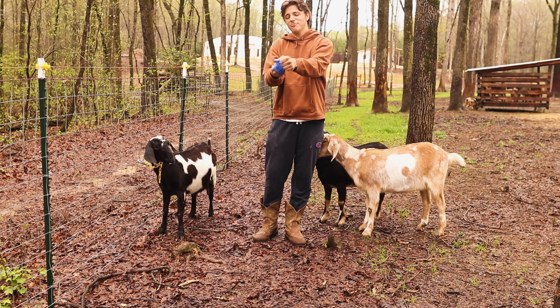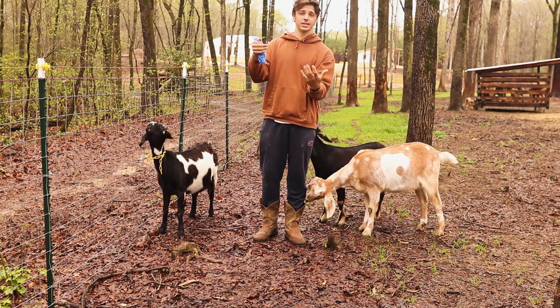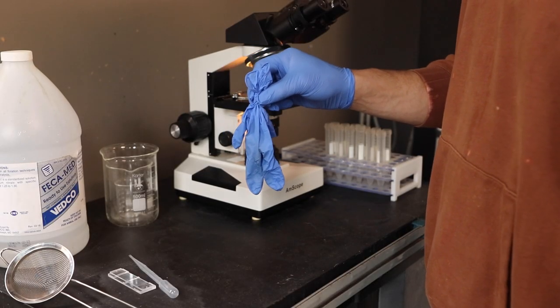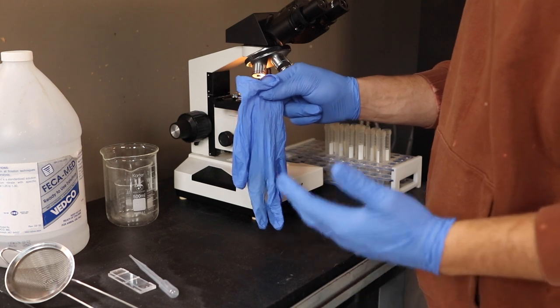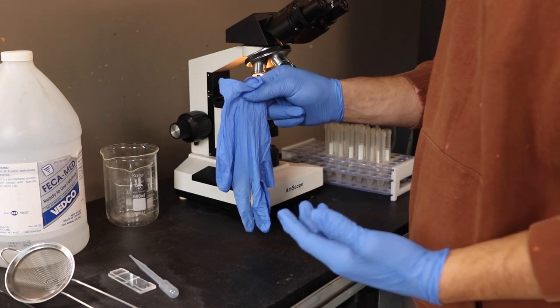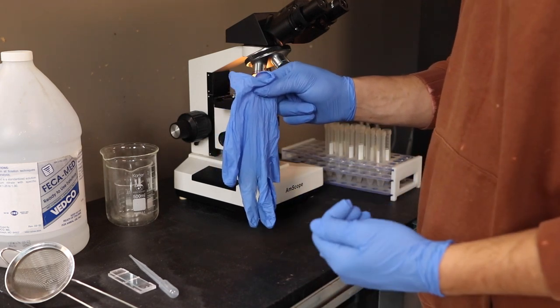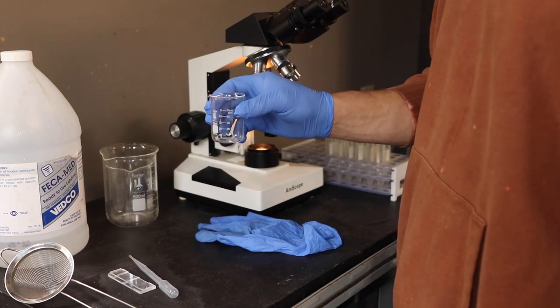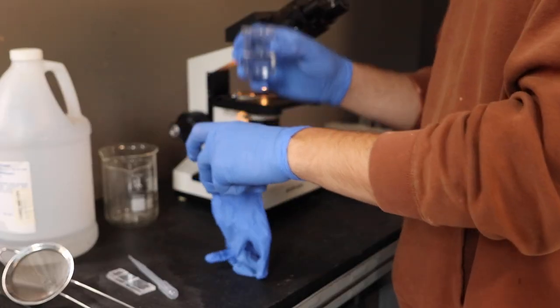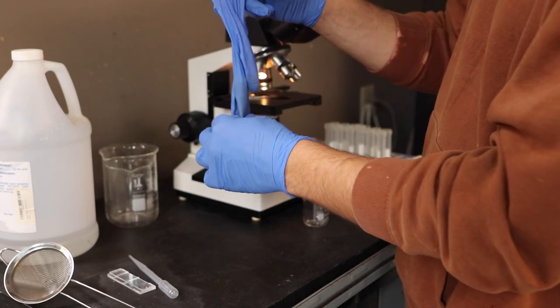I'm going to go ahead and twist my glove inside out — this is what we'll add the solution to later. The ratio that we're going to use is 15 cc's of the fecal solution for every one gram of goat poop. We have two grams of goat poop, which means we're going to use 30 cc's of the fecal solution. I'm pouring 30 cc's of the solution into the glove. The next step is to mash up all the poop so that there are no big chunks getting stuck in our strainer or going into the slide.